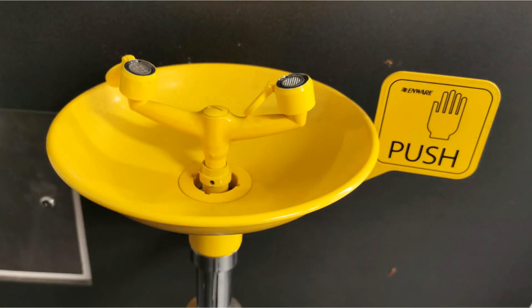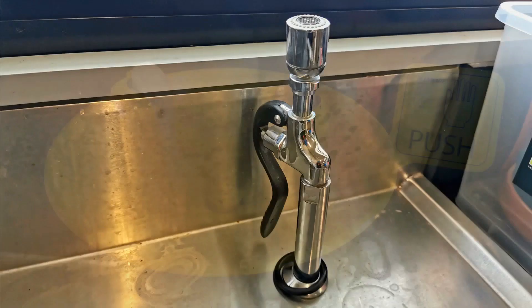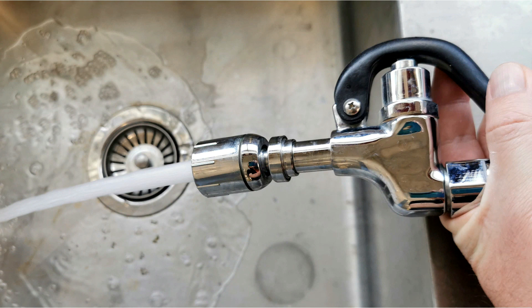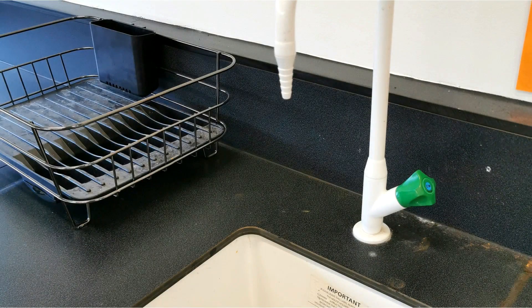This is an eyewash station — you just push the big flat push-sign and the water starts coming out. Usually in labs there are also handheld ones where the water comes out the top and you pull the trigger. These tend to be not all that gentle, but if you've got chemicals in your eye and it's a burning sensation, this would be the best option. And of course that goes into a sink — any good science lab should have a main sink as well as individual sinks around the lab for students.